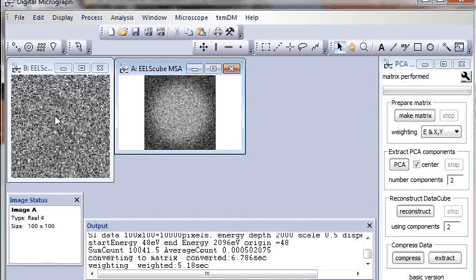But energy specific information is actually not lost. It's attached to this image in hidden form, a form convenient for further multivariate statistical analysis. And the first analysis we will do with this matrix would be extraction of principal components.